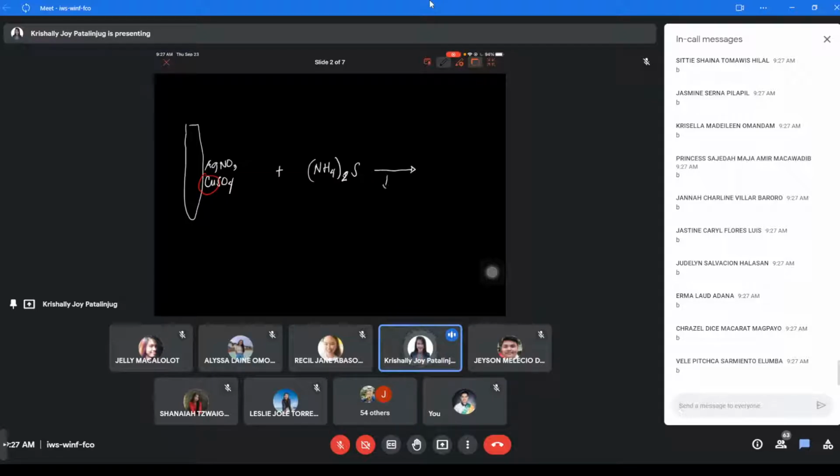And what is the pH? Low pH, because it is an acidic environment. What is an example of a compound that can acidify the environment here? For example HCl, or sulfuric acid. It depends on the actual procedure. But again, this HCl will not react with the ion of interest. Only the main precipitating agent will react.